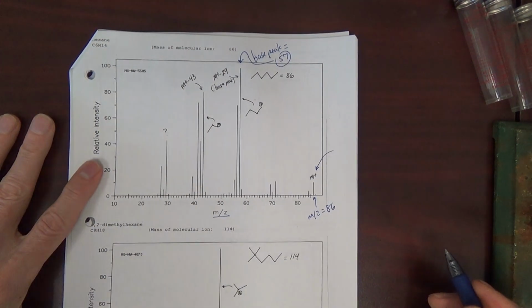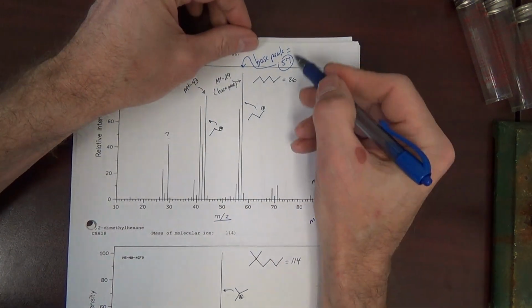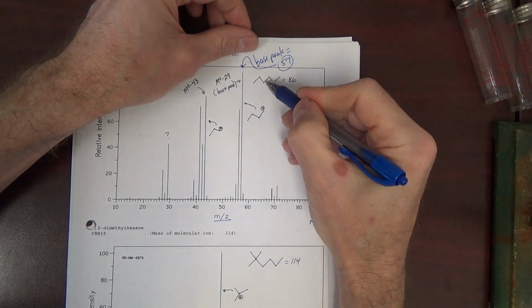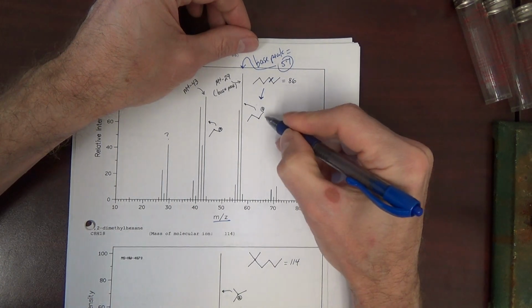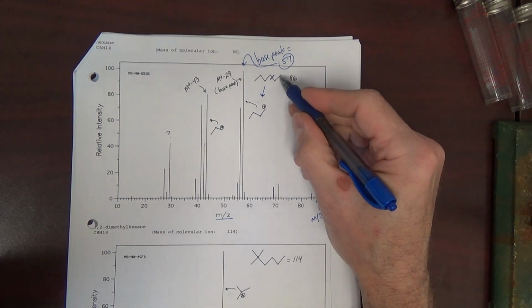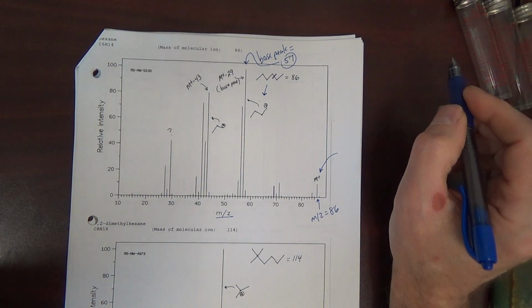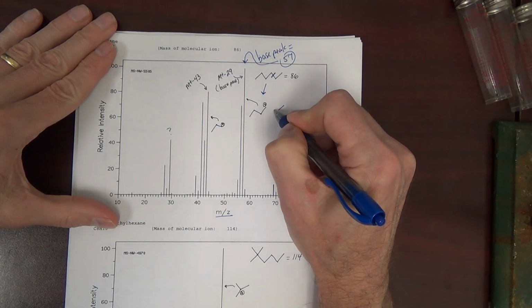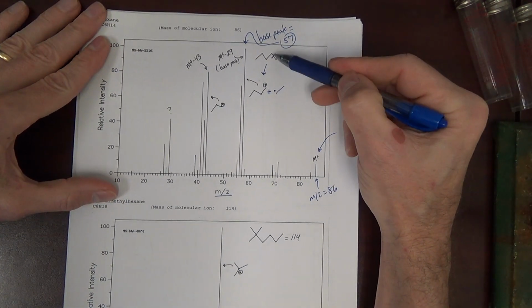How could this molecule cleave to give 57? It would have to cleave right here. If it cleaved there, we could say it gave this cation. One thing I'm not going to show is any mechanism for the cleavage. We know we're dealing with a radical cation. It's going to cleave in a certain spot to give a radical and a cation. Here's a cation we could show. The other portion would be this 2 carbon, and that would be a radical. So we can show cleavage here.